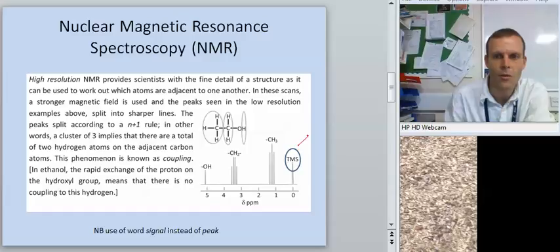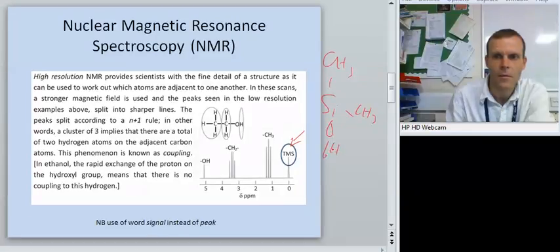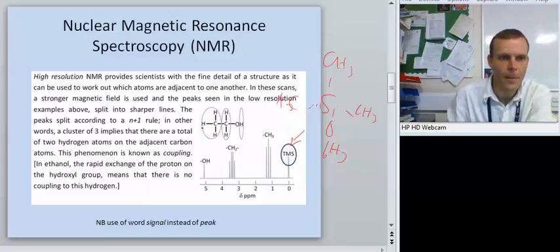And we also mentioned the fact that we had this internal standard tetramethylsilane, which looks like this, and that is set as 0, and then we've got all these shifts based relative to that. But we learned the number of environments, how many H's were in each environment, and we could look at our low resolution trace and see that.